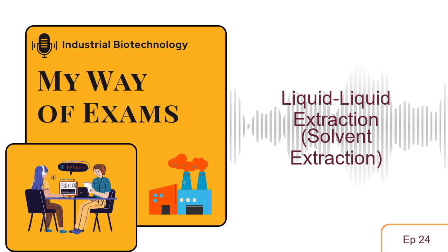We're all about getting you up to speed quickly. No time wasted. So today, we're going deep on something pretty fundamental. We're talking about liquid extraction, LLE. One of those essential processes you need to know. It's all about taking, say, raw material from your fermentation and getting that pure product out.